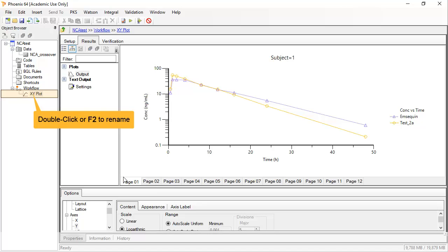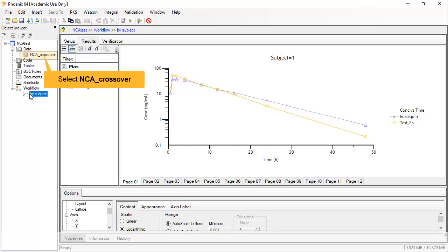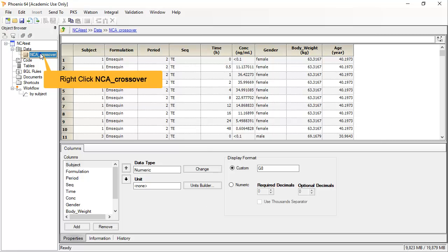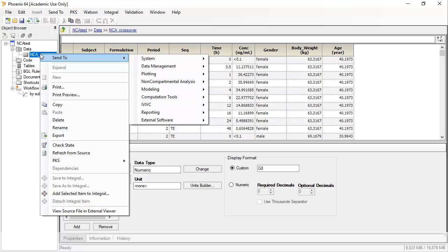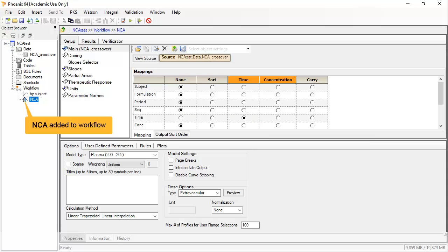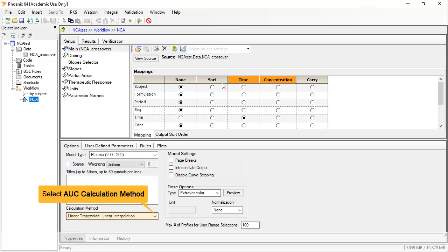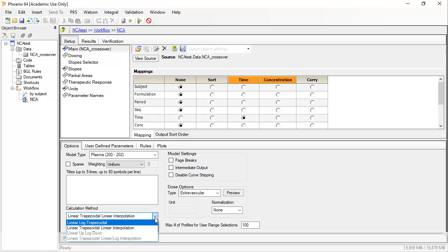To perform more analyses on this dataset, one can return to the data folder and select the original worksheet. Then right-click and send to Non-Compartmental Analysis, before choosing NCA. Again, we see the object is immediately added to the workflow and the source data is linked. Various options can be set to match your analysis plan. For instance, linlog trapezoids for AUC.